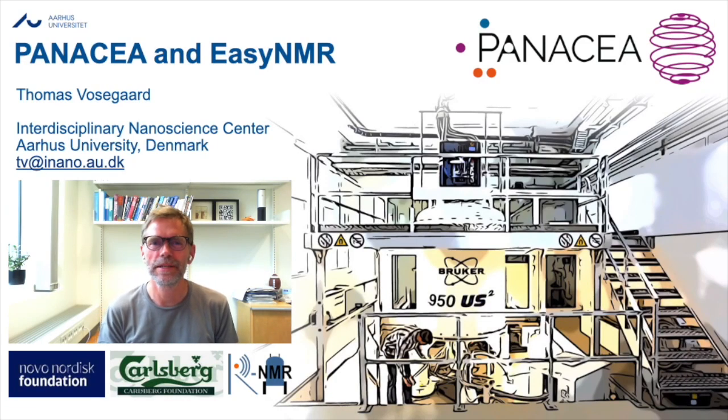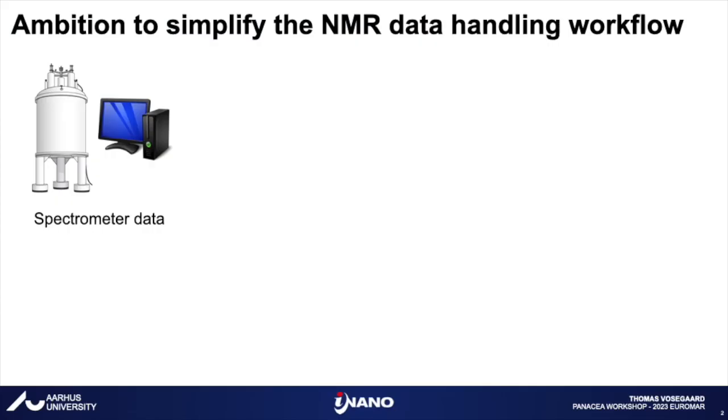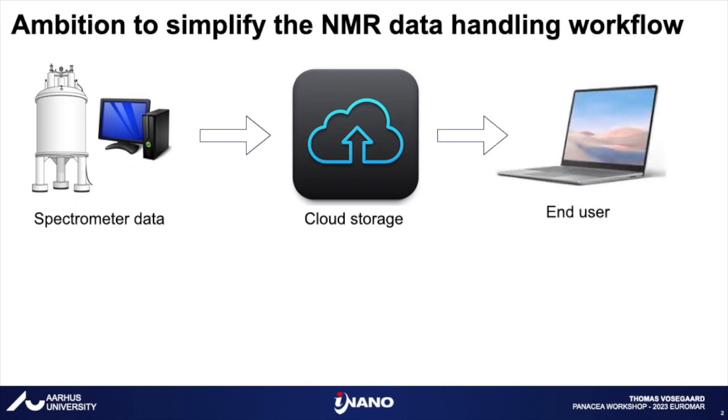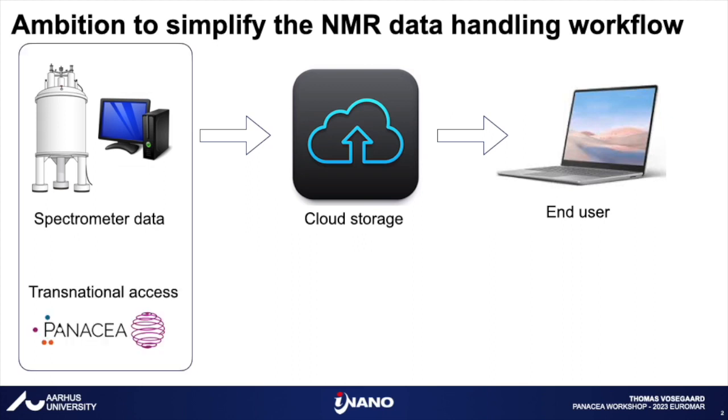I'm sorry I can't be at the EuroMar this year, but I will give you a short presentation of EasyNMR and how we use EasyNMR in the context of PANACEA. So our ambition is really to simplify the NMR workflow as a whole. We start out with the spectrometer data, we upload that to a cloud storage, and then we submit that to the end users. This is the basic workflow of PANACEA when we provide transnational access.